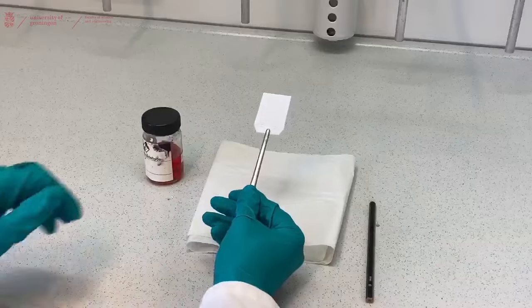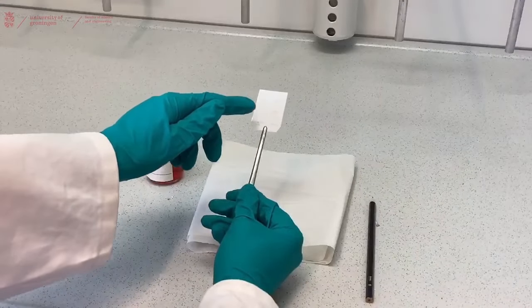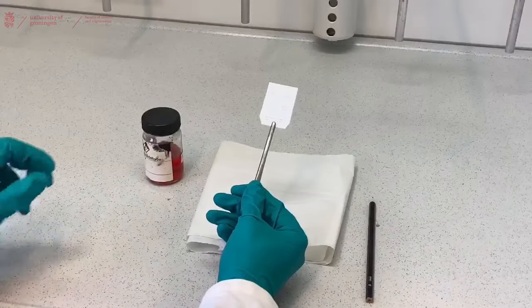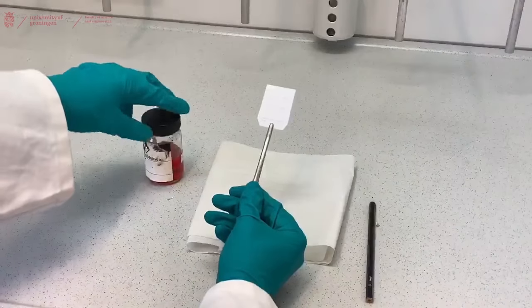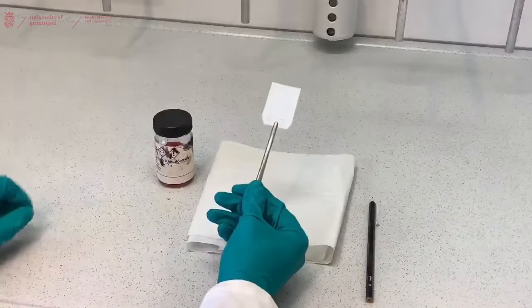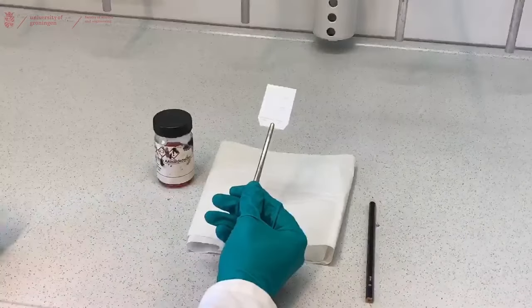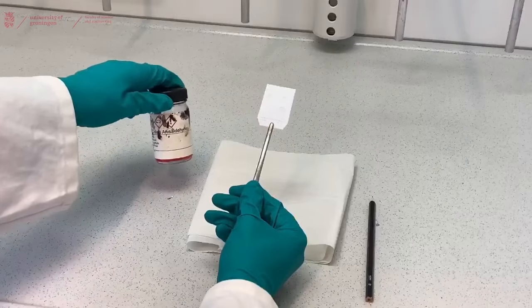We tested our TLC plate for visible spots and for spots that are visible under UV light. But it might be that there are spots on your TLC plate that are not visible under UV or by the naked eye. So what you can do is stain the TLC plate using chemical stains. These chemicals will often react with compounds on your TLC plate. In this case we are going to use the TLC stain anisaldehyde. To use that you just open your stain jar.